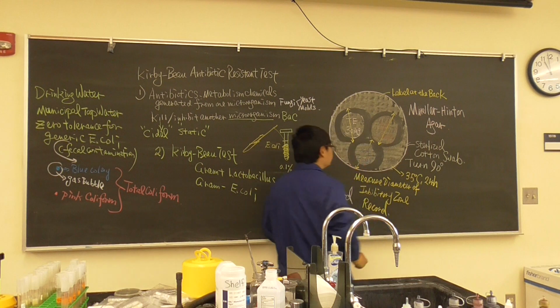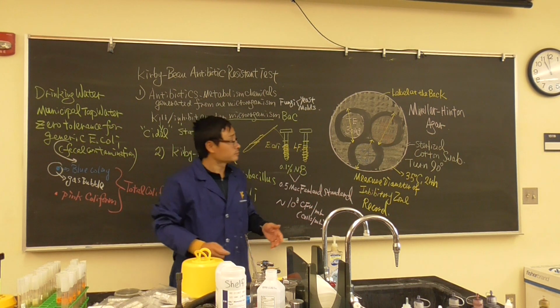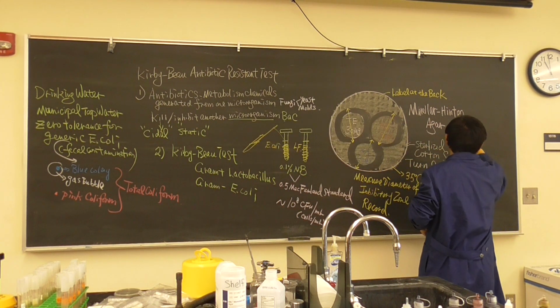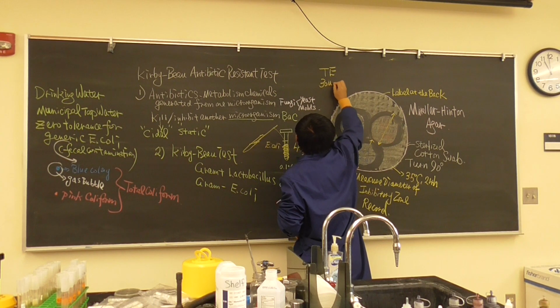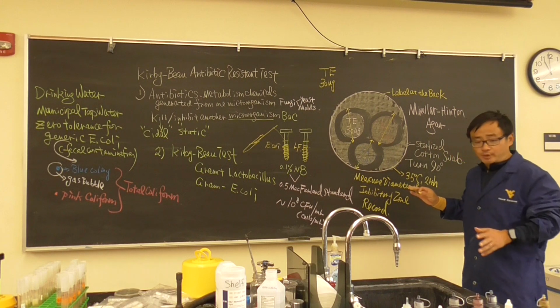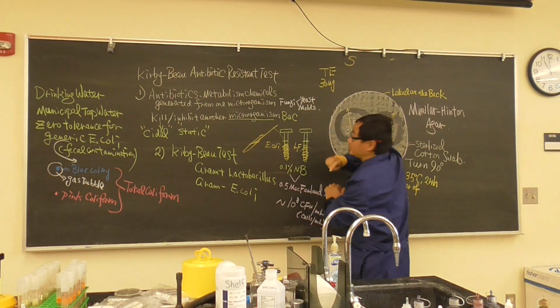Okay, here is the key. Every inhibitory zone represents the bacteria's response to the antibiotics. I'm going to give you one example. Let's say you have tetracycline, which is 30 microgram. The bacteria's response to the antibiotics basically has three categories, the first being S, susceptible.